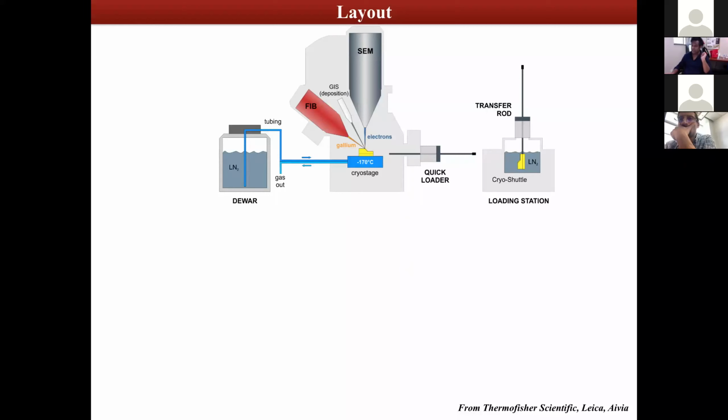Please note that this is a really great technology, because in a TEM, you have a very small space to maintain that kind of temperature. If you are using a single tilt holder, the holder has a liquid nitrogen dewar at the end of it, and it cools the system. And that's a very tiny little space for the grid.